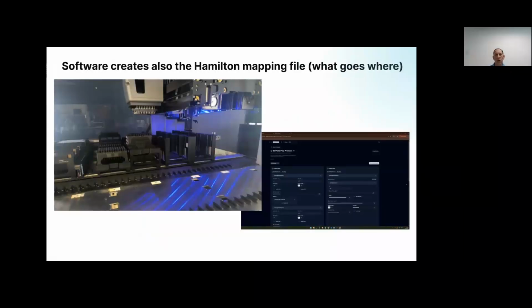And also with these BLI plate maps, I can go to the liquid handling instrument. We use a Hamilton liquid handling instrument. The software already created the mapping file that tells the instrument what to do and where source channels on the expression plate should be pipetted into in the BLI plates.